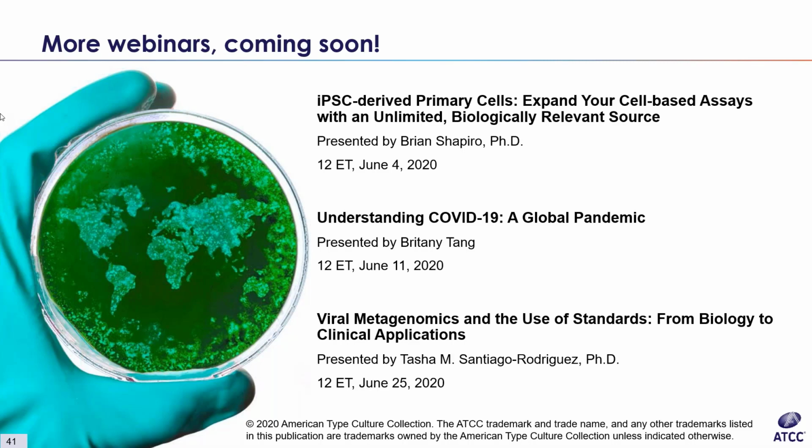They're very useful. And I don't know if you've used other containers, like the plastic containers that contain the alcohol that get very cold to the touch when you put them in -70. The lids tend to stick, but the containers work for all the different cell types. And this foam material allows it to not be so cold when you take it out, so it's not too cold to the touch, and the lid comes off easily and things of that nature.